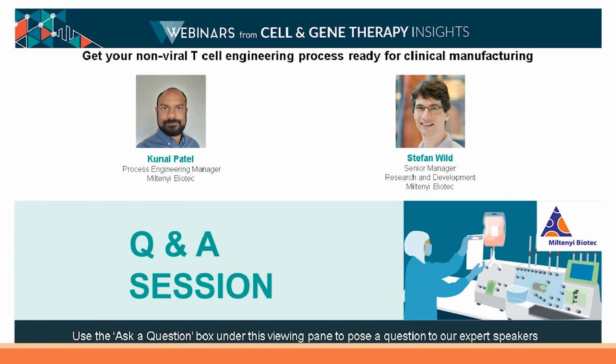At least in our clean room spaces at the San Jose site, we're maintaining our clean rooms as, I believe, a Class B background. Whether or not that's necessary for your specific program is going to depend on the classification or category of how your treatment is seen by the regulatory agency. There are cases where you could do processing of minimally manipulated cells out in a Class C, but it really just depends on your specific therapy.